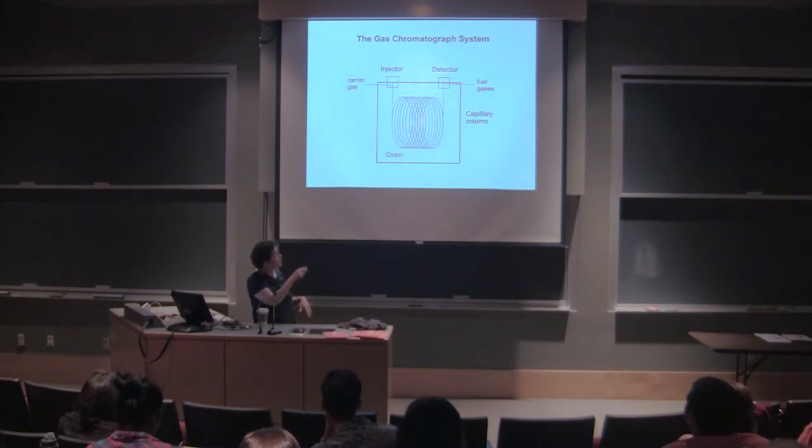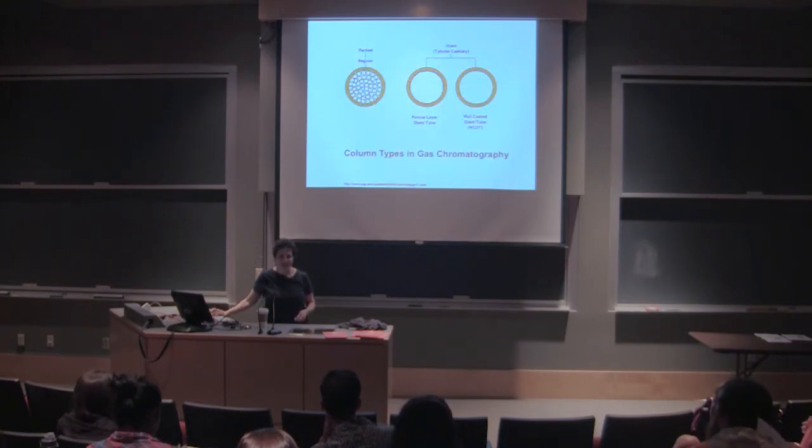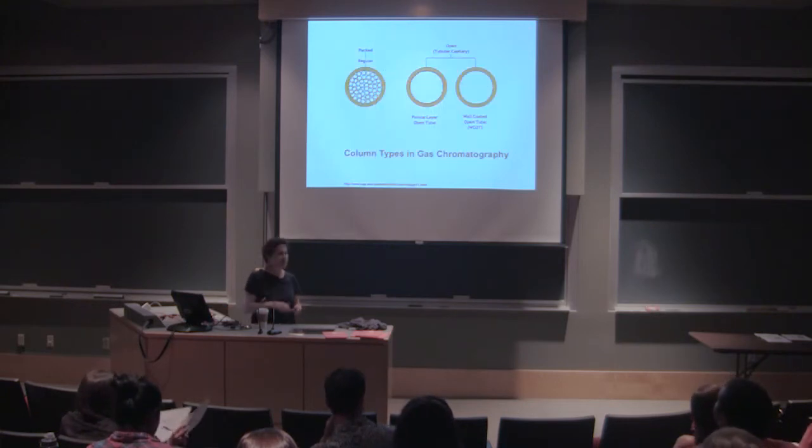So we have mass spectrometers as detectors, but we also have capillary columns as inlet systems. So let me show you a cross-section. I am actually trained in geology, so I like cross-sections. But this is at a different scale than you normally see in your geologic cross-sections.